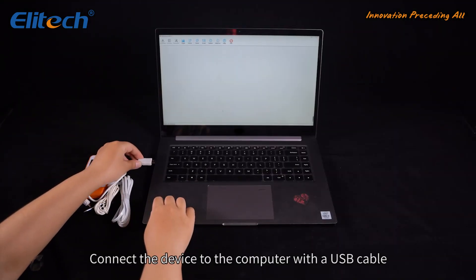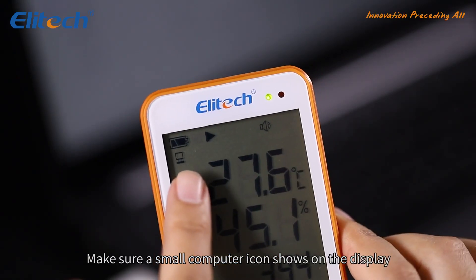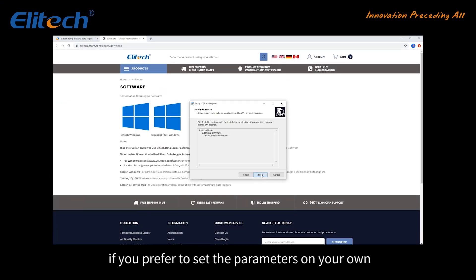Connect the device to the computer with a USB cable. Make sure a small computer icon shows on the display. Go to the Elitech official website to download software if you prefer to set the parameters on your own.